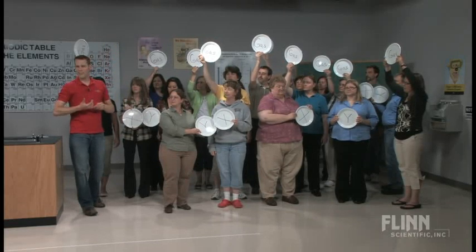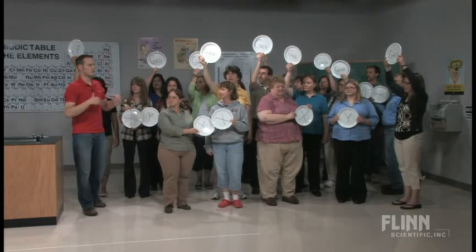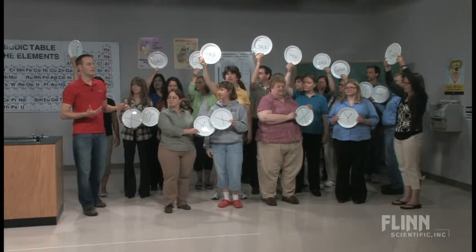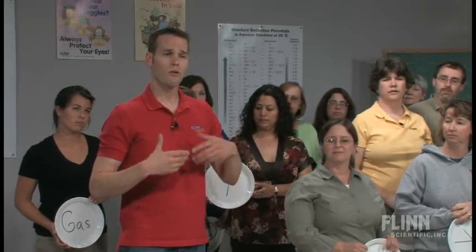So the more that we can get to react, we can also demonstrate the effects of concentration on the reaction or increased agitation. So you guys can put your arms down, let the blood back in, but it's a really nice, elegant demonstration of what's happening on the molecular level. I do have one other variation of this, how we can visualize things in reactions with not being able to see inside of the flask, but another way we can see what's happening on the molecular level.